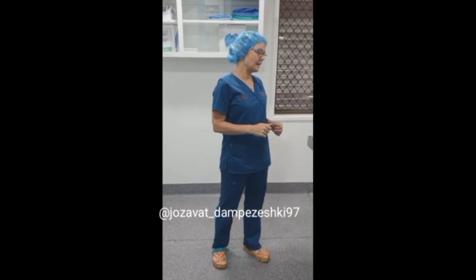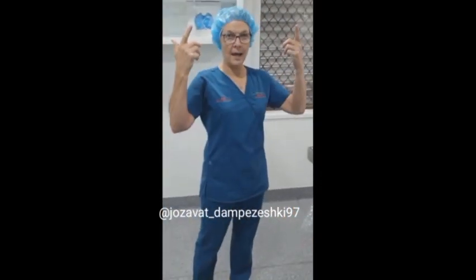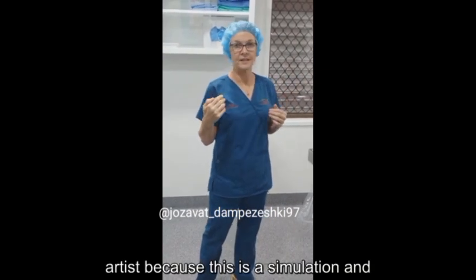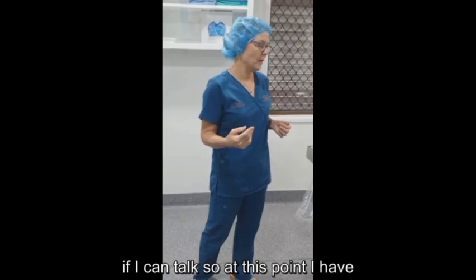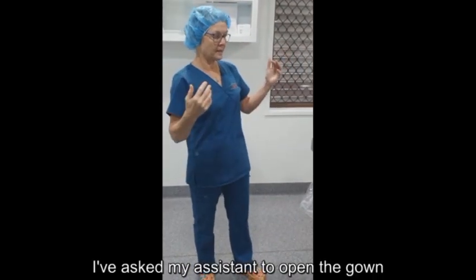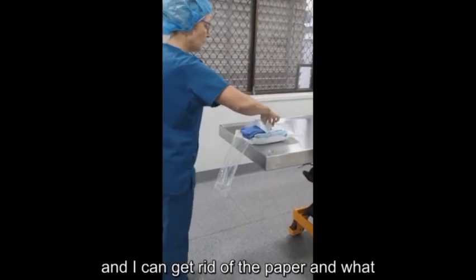We're going to demonstrate application of a surgical gown. I will already have a cap and a mask on, but I'm not going to wear a mask just because this is a simulation and for the purpose of education it's easier if I can talk. So at this point I have already scrubbed. I've asked my assistant to open the gown for me and I can get rid of the paper.